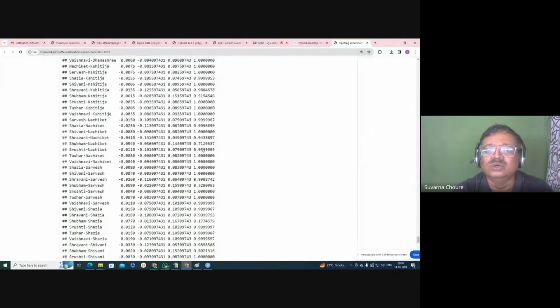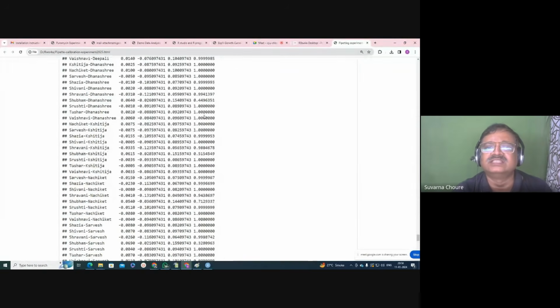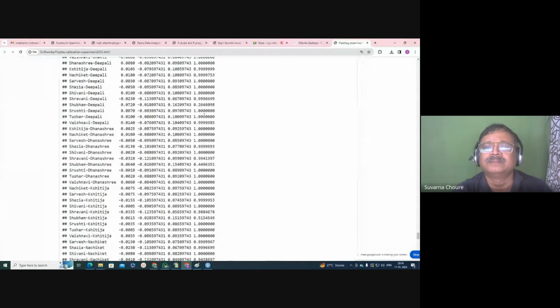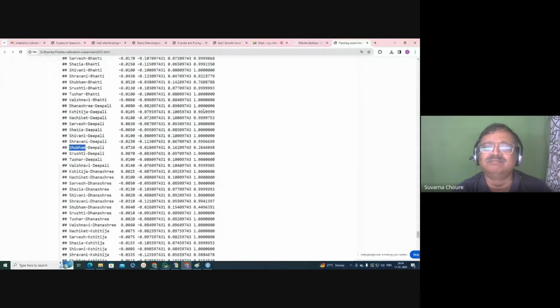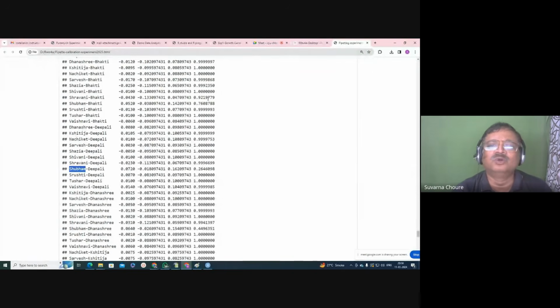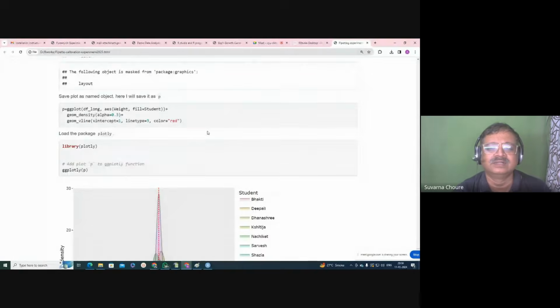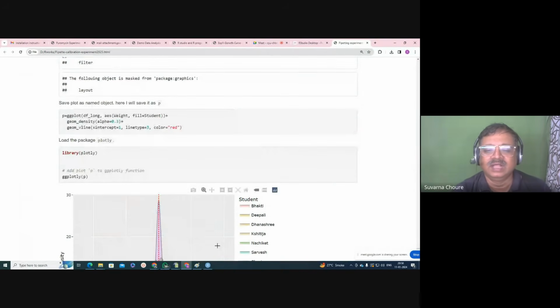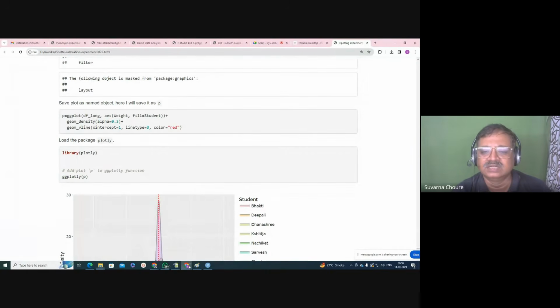These numbers actually don't show much efficiency. No statistically significant difference is there in pipetting. This accuracy is less, Shubham and Dipali, because Shubham's readings are quite wavered. Shubham is very good at software and doesn't have much good practical hand because his orientation is not working practically. Okay. And another experiment which we will stop within few minutes.